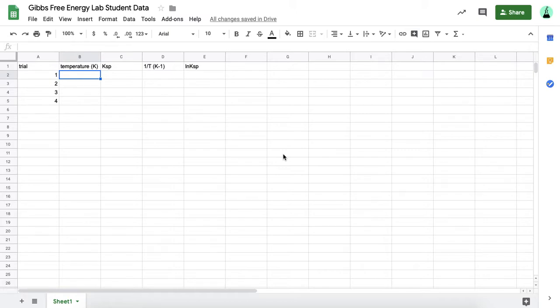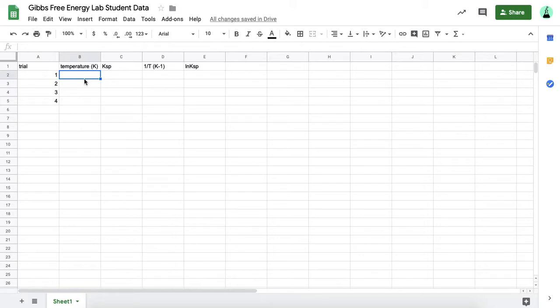For our Gibbs Free Energy Lab, I'm going to provide you with this Google Sheet in Google Classroom. It has the four trials that you'll conduct. It has a place where you'll record your temperature at each trial and what you've calculated as the solubility product constant for each trial.